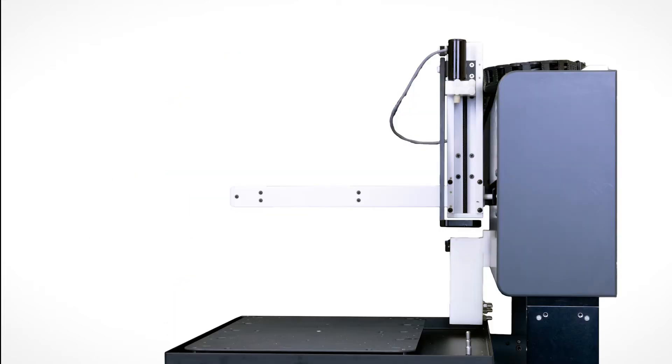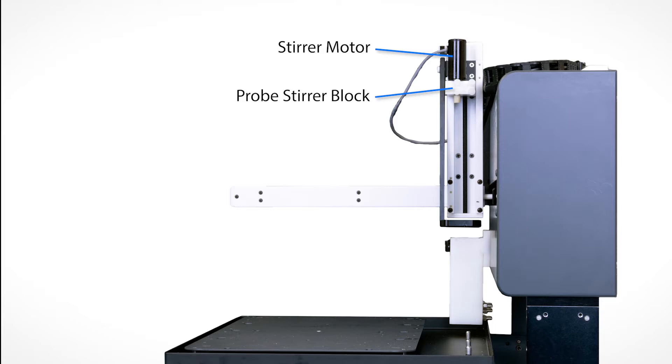Attached to the Z-Drive are the stirrer motor, the probe stirrer block, and the drip cup holder.